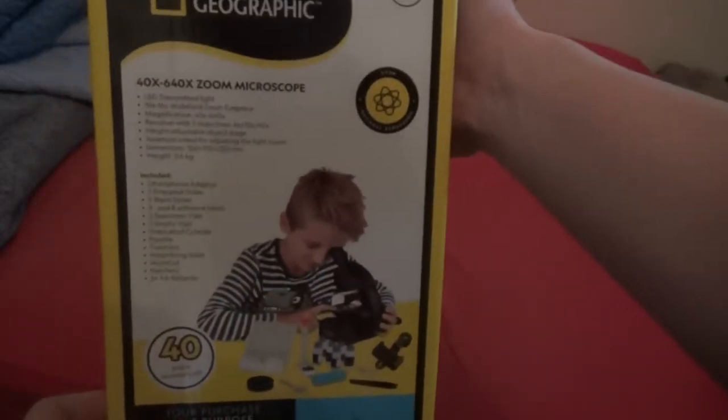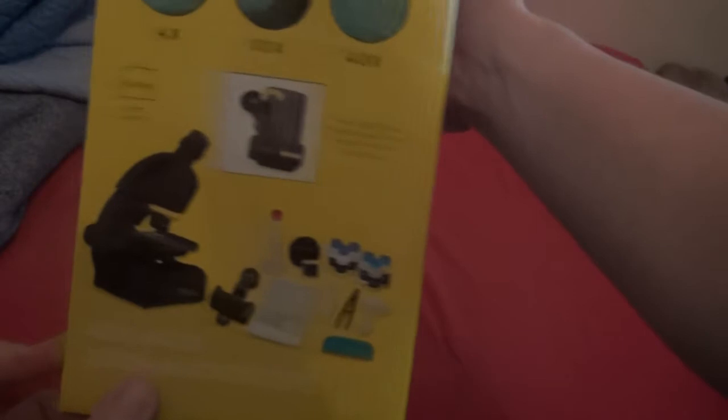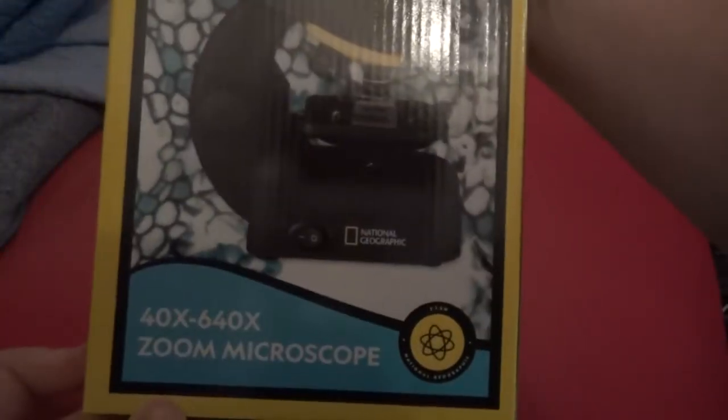This is the back of it, and this is the side. It says red, and all the stuff that comes with it. It can go from 40 times magnification to 640.